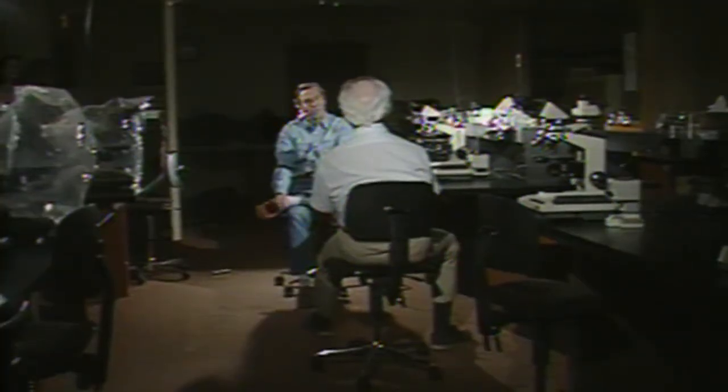What you're doing is magnifying these little particles up to the size that we normally see macroscopic objects. And if we can recognize all of these things here, just at sight, you can do the same thing under the microscope. It's that easy. For Chicago Tonight, I'm Nick Blumberg.